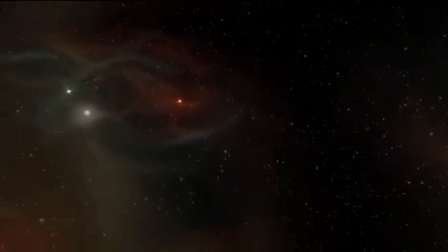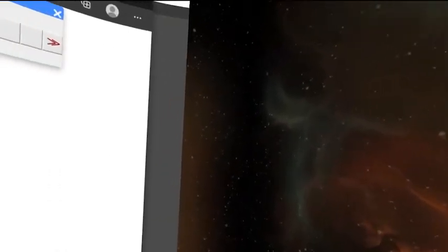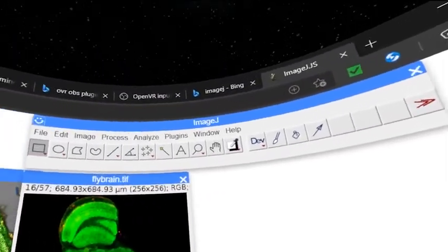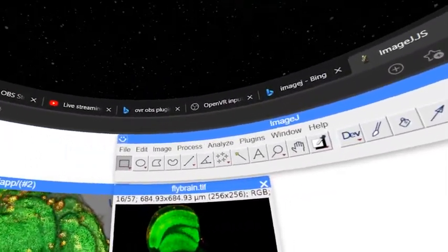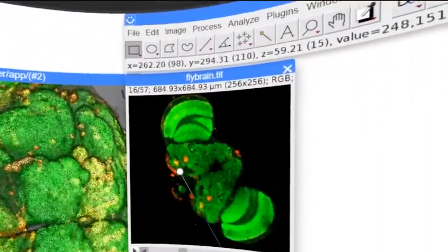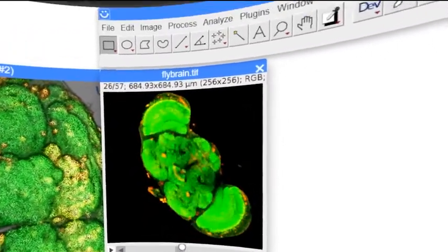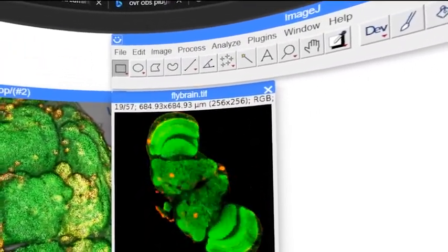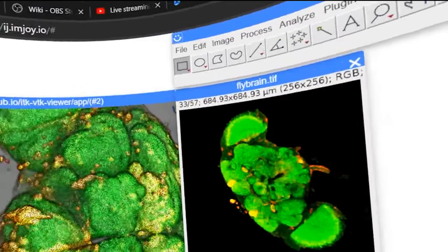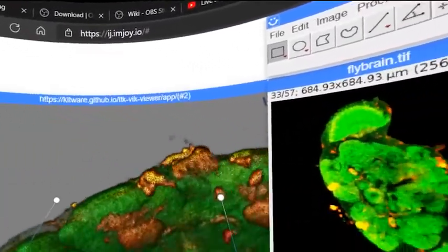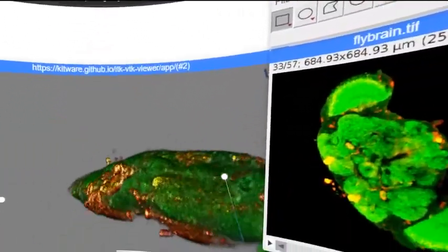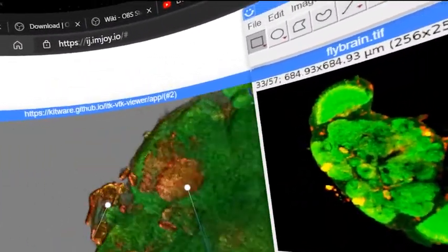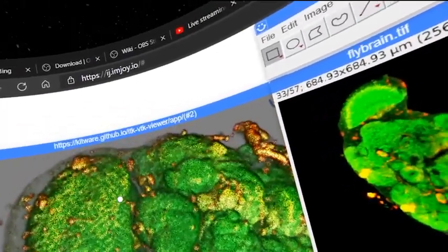Imagine a virtual world not too far away from here where ImageJ runs in a browser, a browser suspended in a massive window that's suspended in space, and the 3D plugin works an absolute treat. How cool is that?